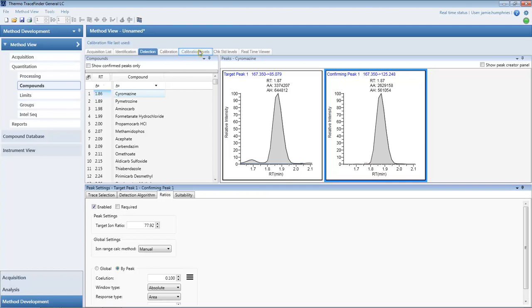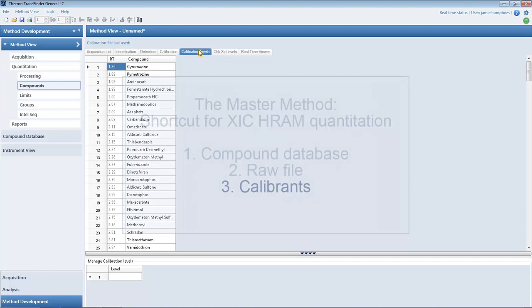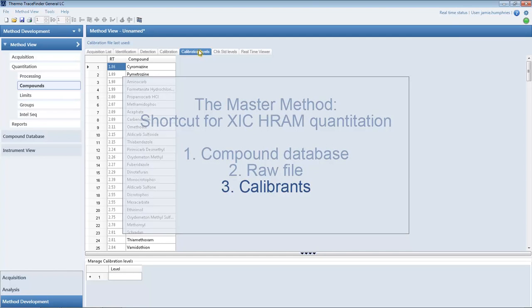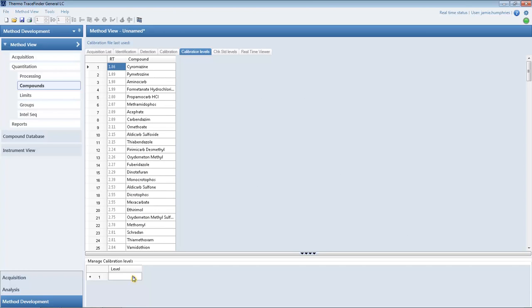The calibration levels are the last data that need to be imported. Copy the calibration levels from an external Excel sheet directly into the grid.